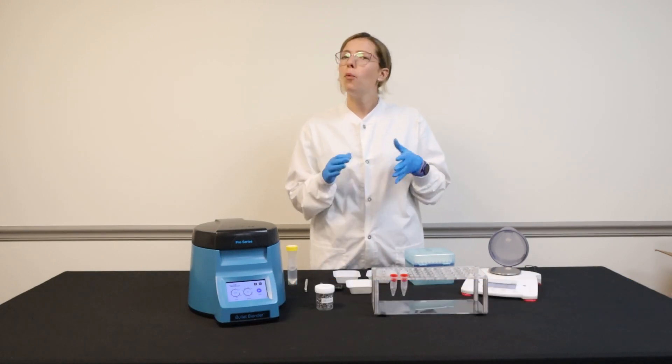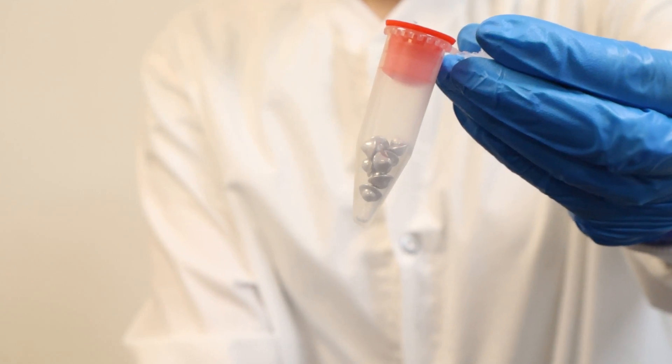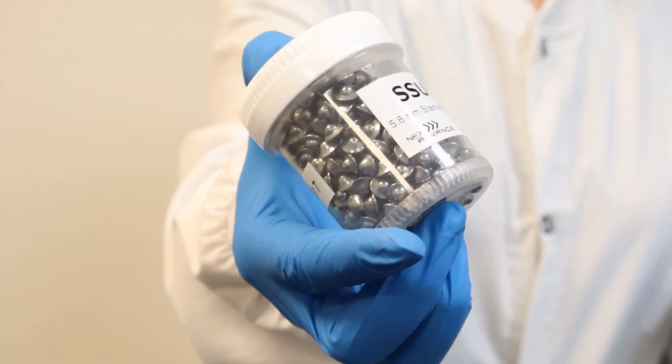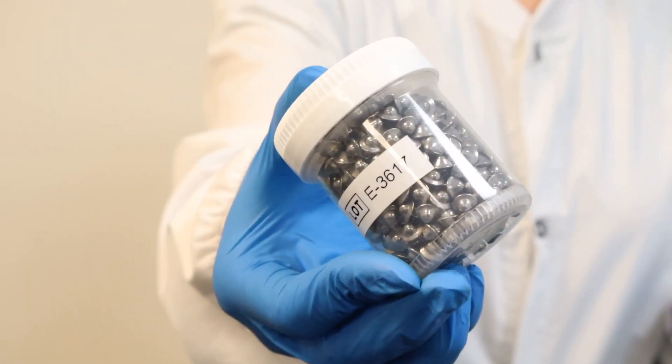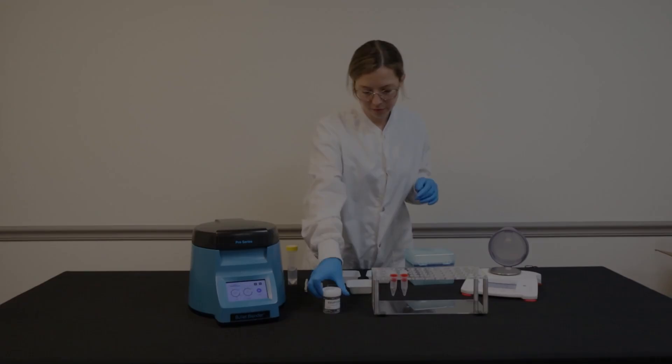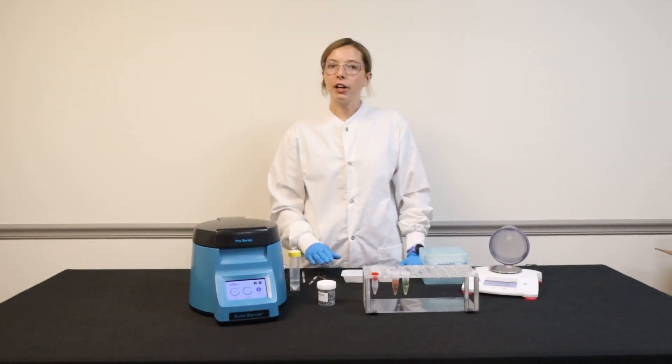We'll most likely recommend using what I have here, which is the Navy kit featuring Next Advance's UFO beads. These beads have a cutting edge that allows them to really get at that tougher tissue.